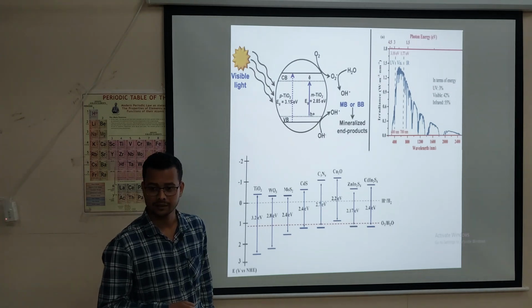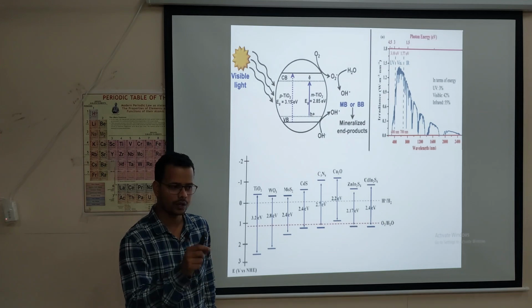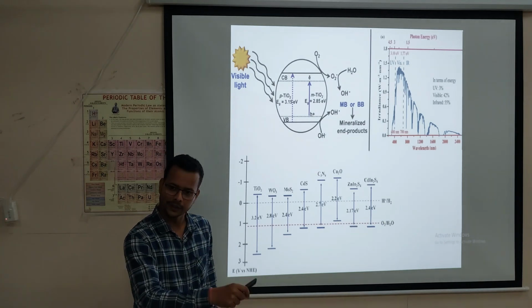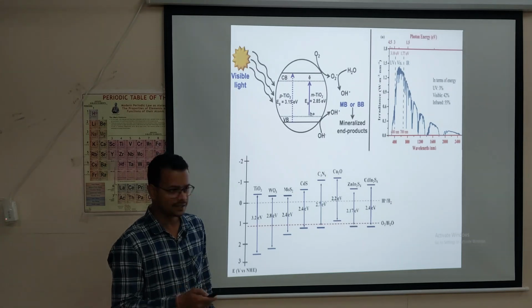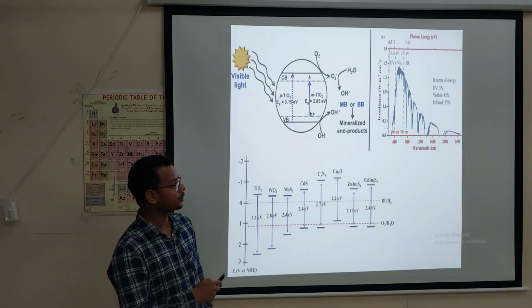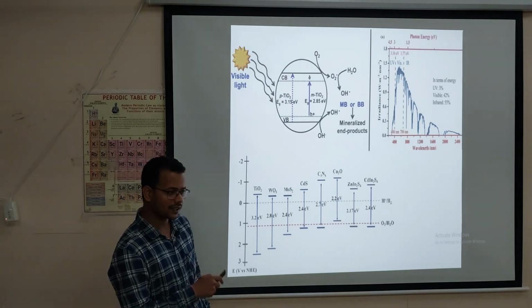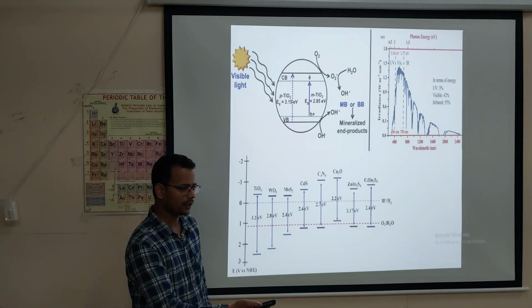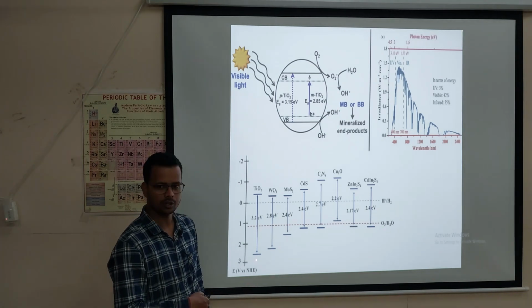And there is an equation in which we have to put that value. After putting that value, from UV visible DRS, I can get the band gap. But to get the value of VB and the value of CB, I have to do electrochemical Mott-Schottky analysis. In that case NHE and RHE or SHE will come.